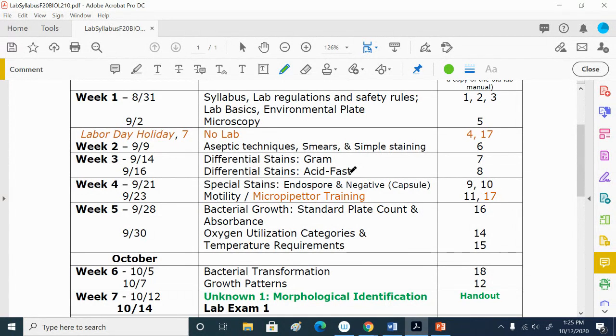And then everything else should be blue, right? Because a mycobacterium is the only thing we're worried about that should turn that fuchsia color. Everything else should be blue. So if you did a sputum smear and you saw those fuchsia rods, what do you have? TB. TB, right? So you never want to see anything that's acid-fast positive in a sputum smear.